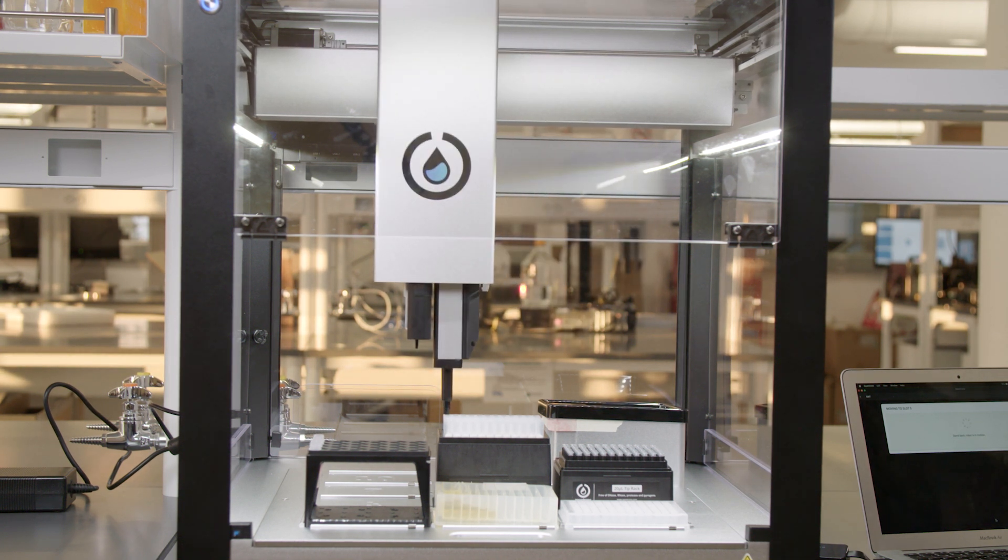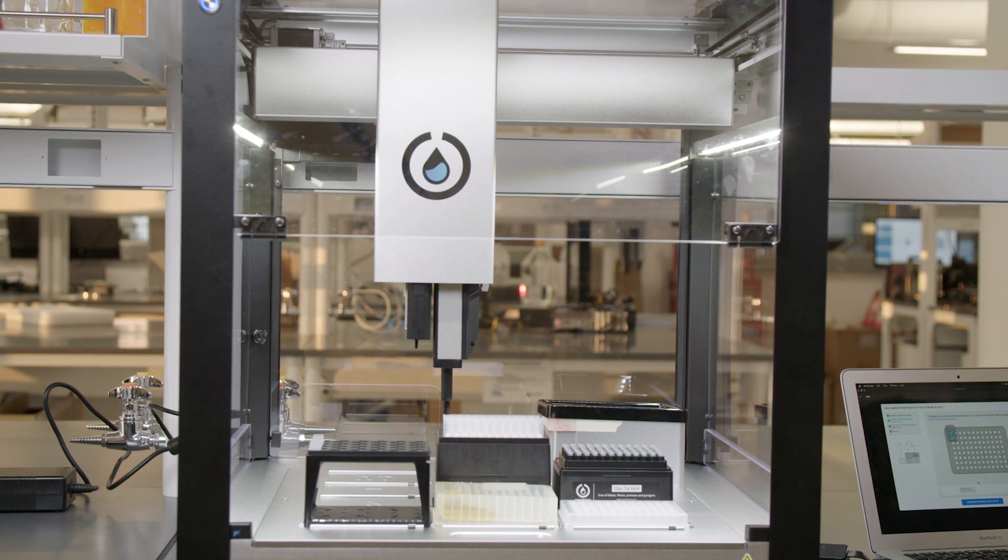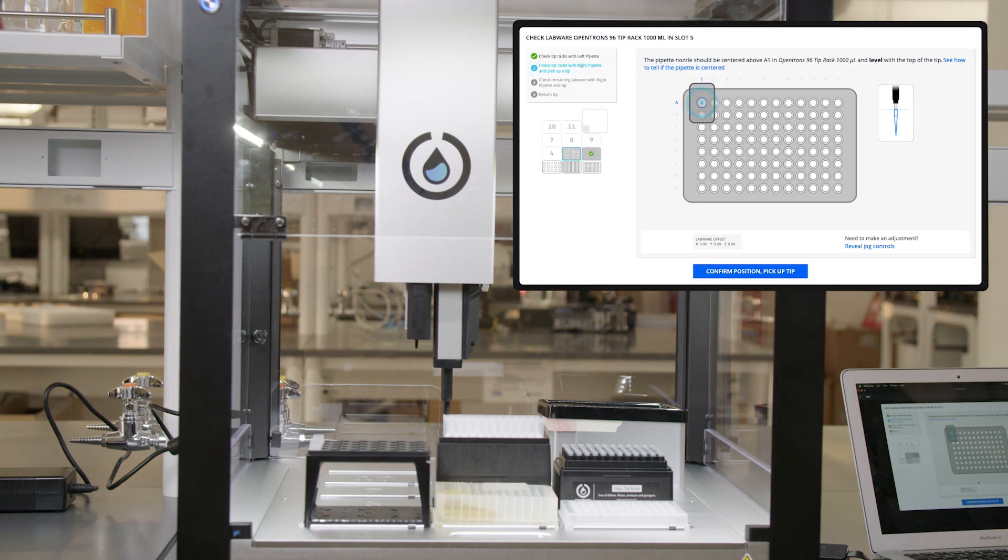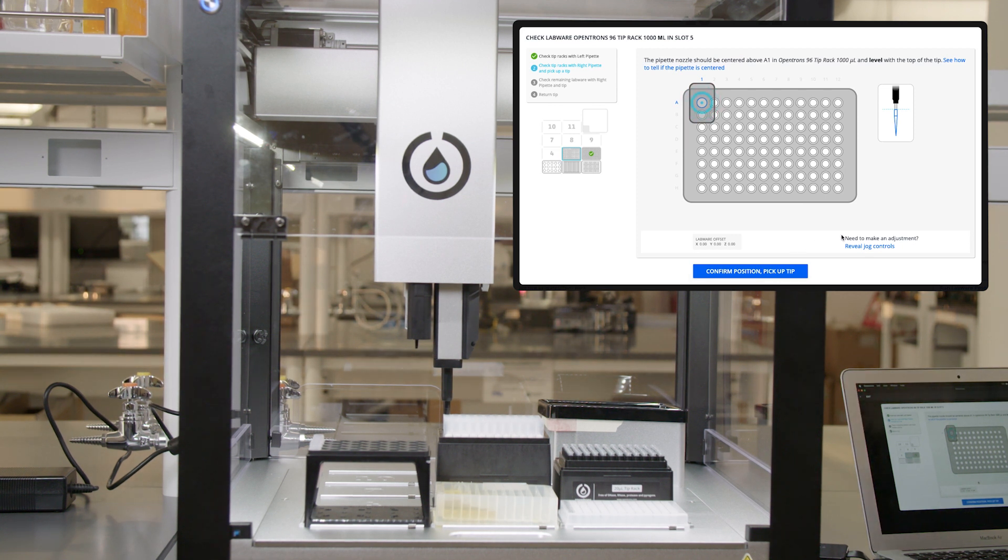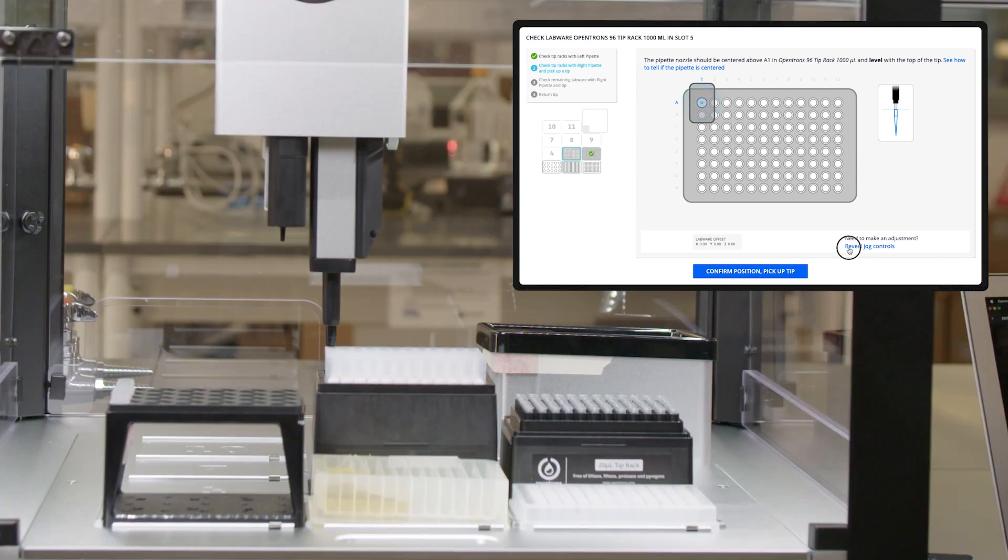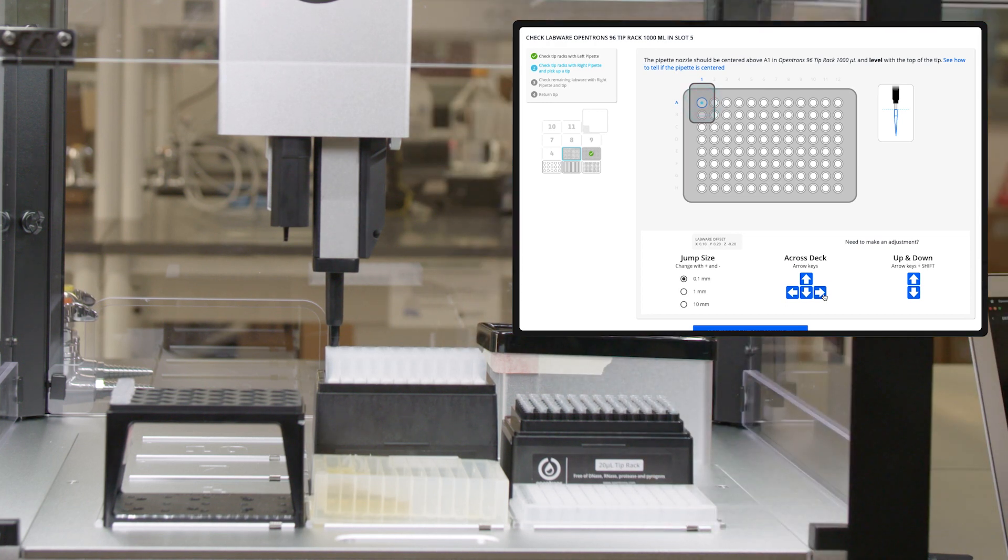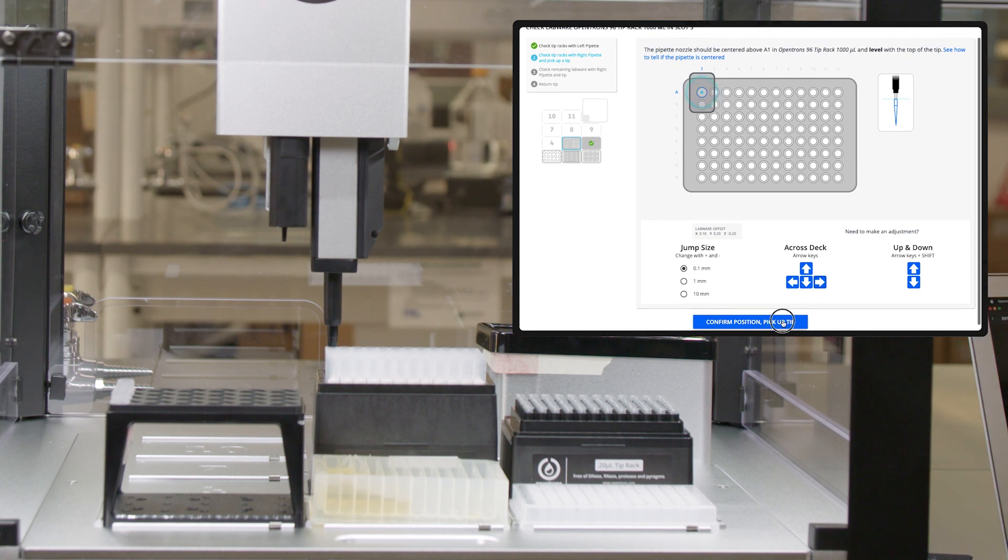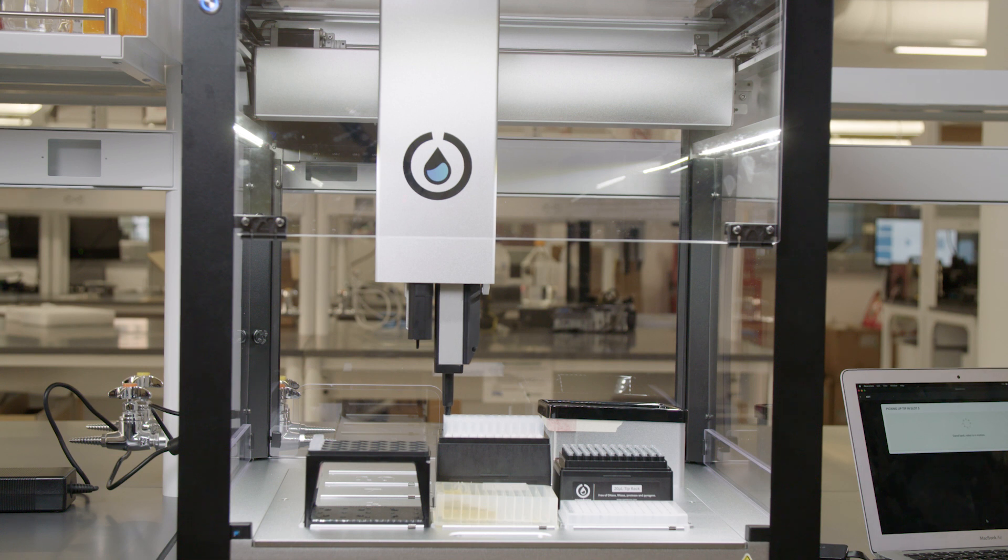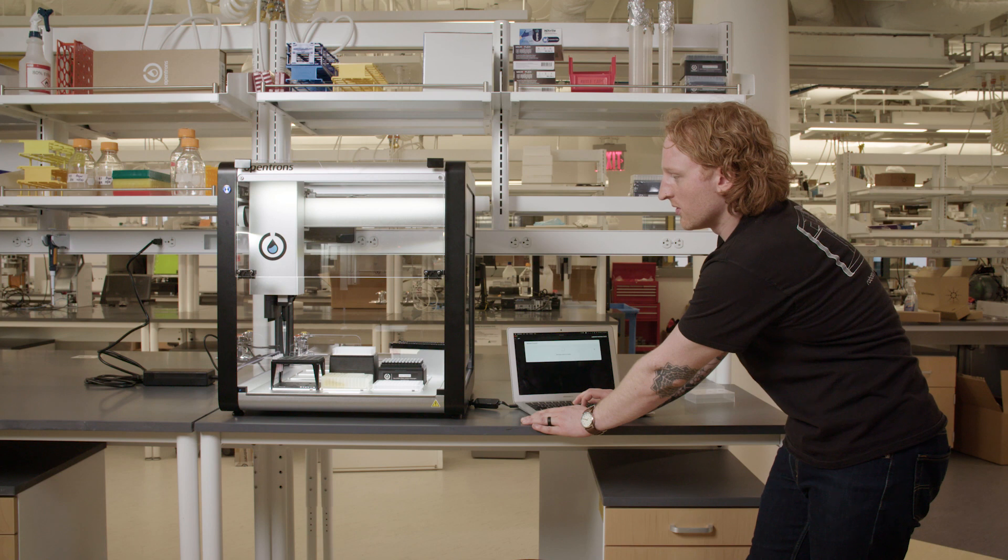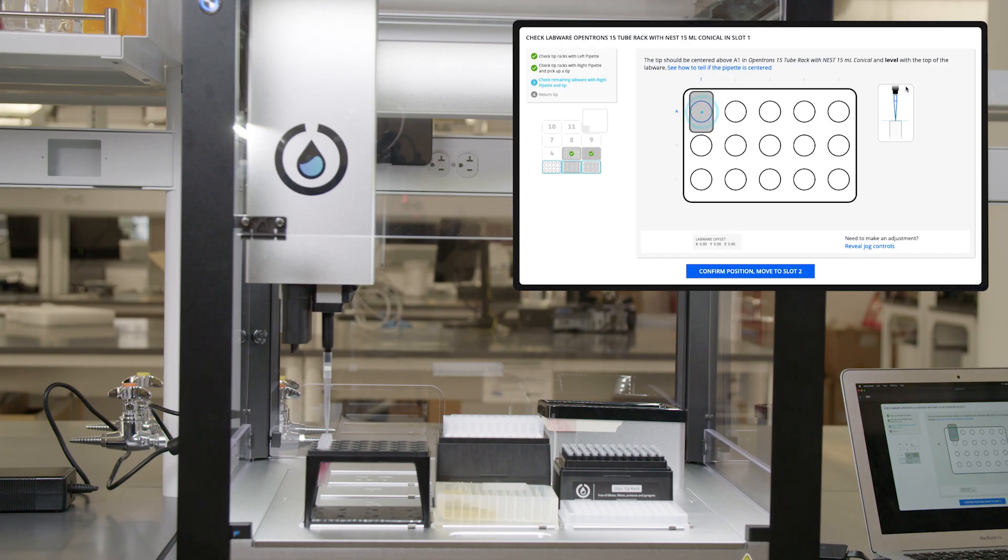The robot will move to slot five and the other pipette will lower down to tip A1. I now need to make sure that the pipette nozzle for my P1000 is centered in tip A1, and that the nozzle is level with the top of the tip. It is a tad bit off. So I'm going to reveal the jog controls like I did last time and move it around a bit. Once it's aligned, I will click on confirm position, pick up tips, and the OT2 will try to pick up the tips. The app will ask me if the pipette picked up the tip successfully. It did, so I will say that it did, and it's going to move to slot one.